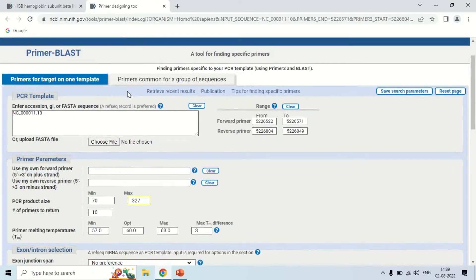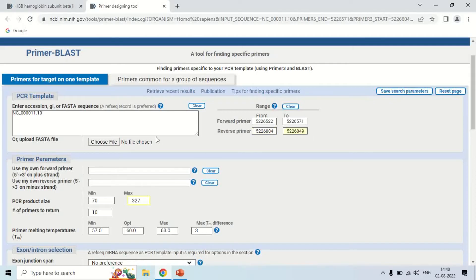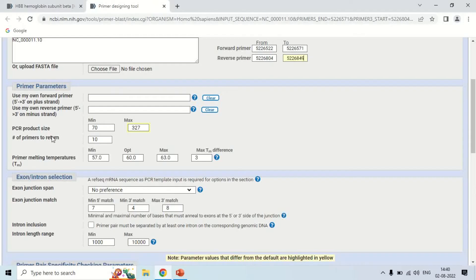In Primer BLAST, it has taken the regions we selected. For the forward primer, the range we selected is shown — the primer will be generated for the sequence from one nucleotide position to another. Similarly, for the reverse primer it will be generated for its selected range. You can also change other options such as product size and melting temperature — minimum 57°C, optimum 60°C, maximum 63°C — or keep these as they are.